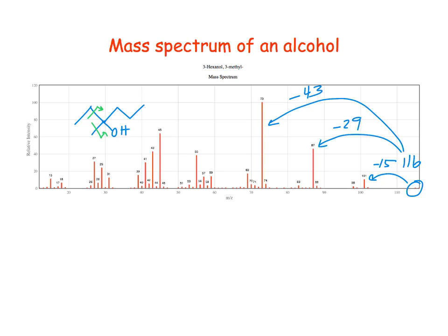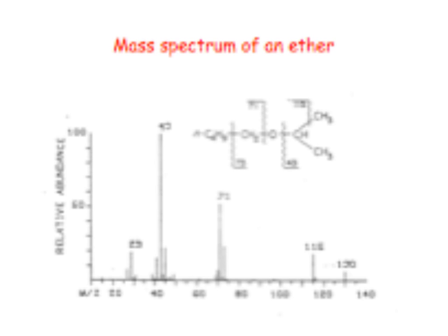So all of those are essentially the same type of cleavage. We just have 3 different groups here. It ionizes like this. We go like this, and we can lose any one of those 3 groups, right? For example, this one. Same thing with this one.